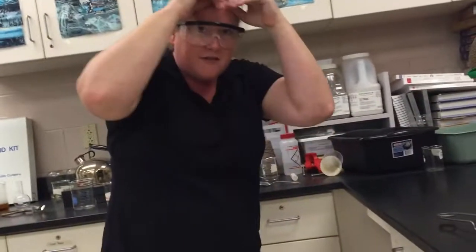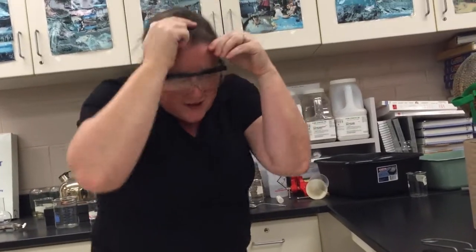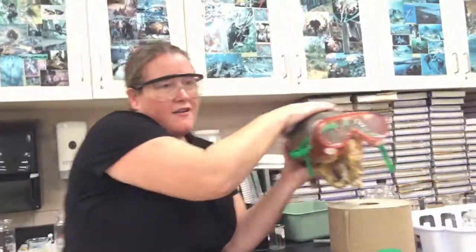So if you imagine me, I'm a copper atom, and I've been thrown into an evaporating dish, and it's getting hot, so my electrons are moving a little faster. It's getting really hot in here, and all of a sudden, under the right conditions, I can grab oxygens from the air.